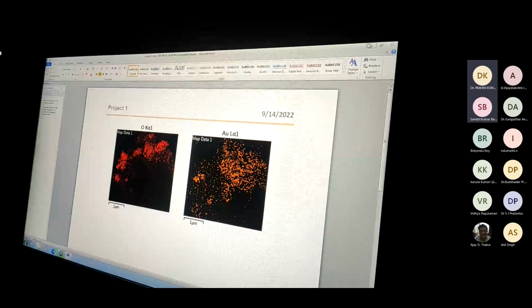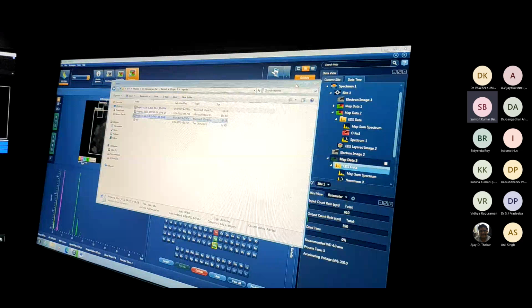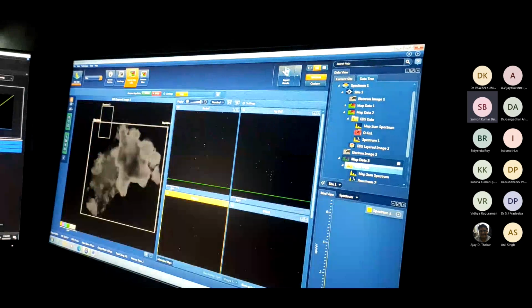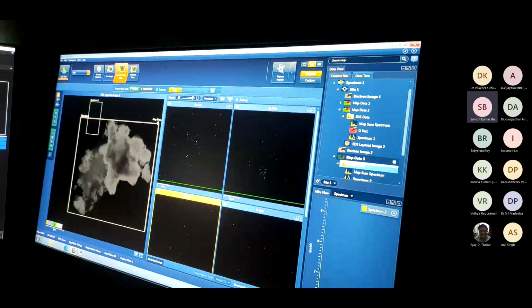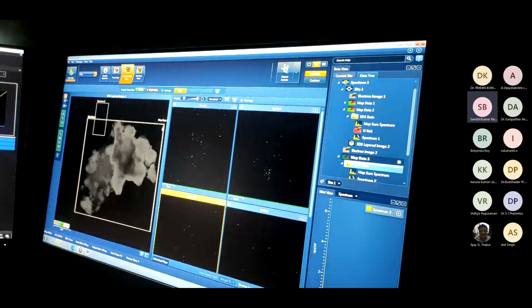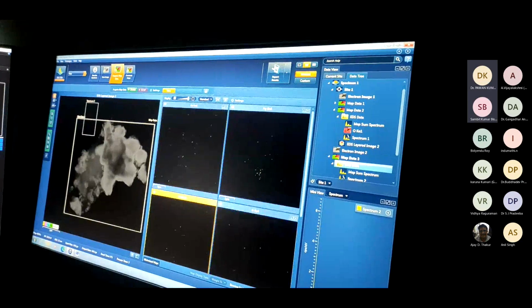Okay, so it was already running. It is running. So we can get the acquired map data, right? I'm moving on to the acquired map data, and I can stop. If we change the location now, we'll get a better result, right? Project 1 is saved.